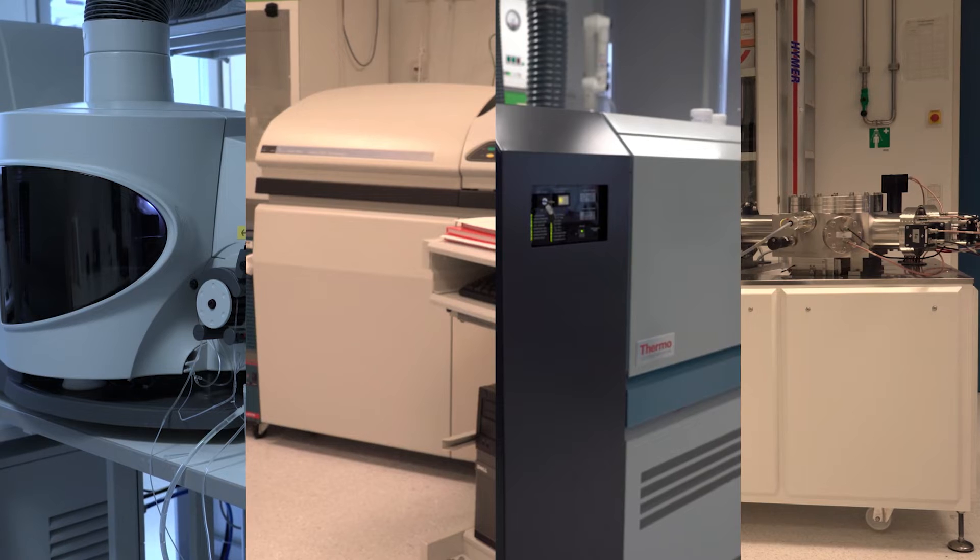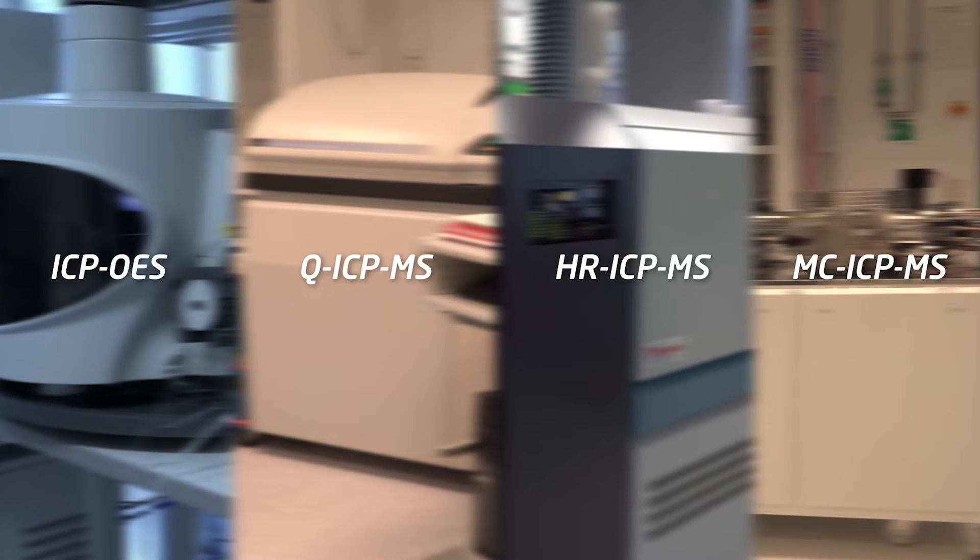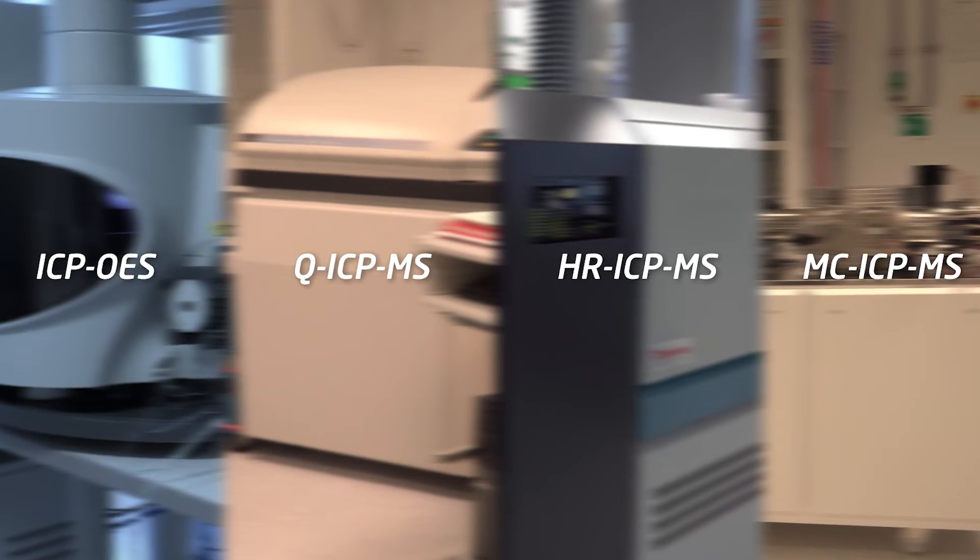In principle, there are four types of ICP instruments. The choice of which instrument to use depends on the elements you are trying to detect and the available resources.